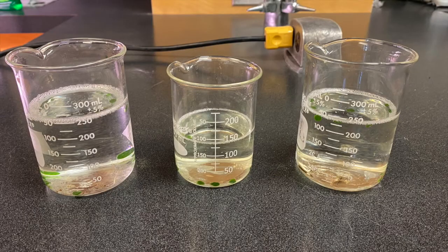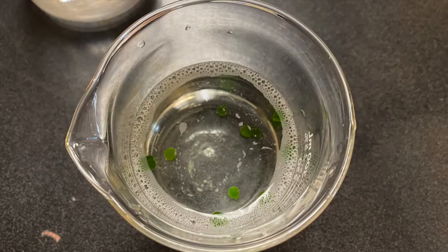The recorded results were: trial 1, red light, 5 floating leaves; trial 2, green light, 0 floating leaves; and trial 3, purple light, with 1 floating leaf. Additional notes were that bubbles were seen in the beakers.